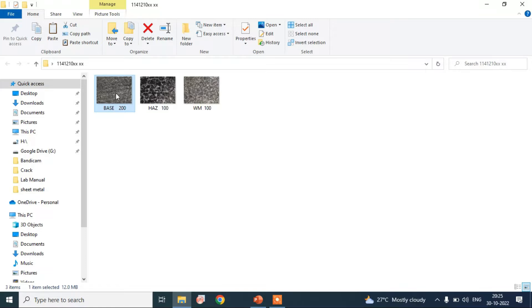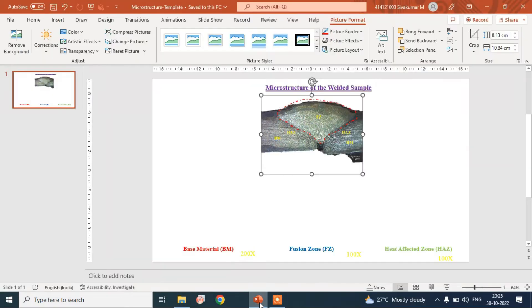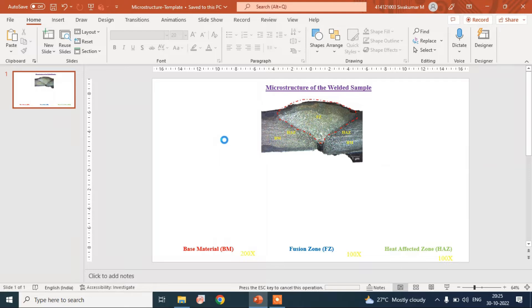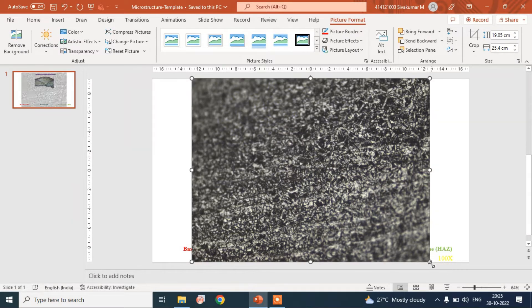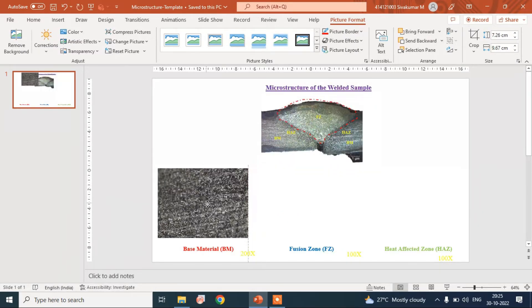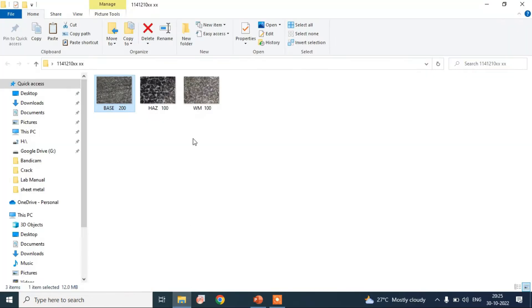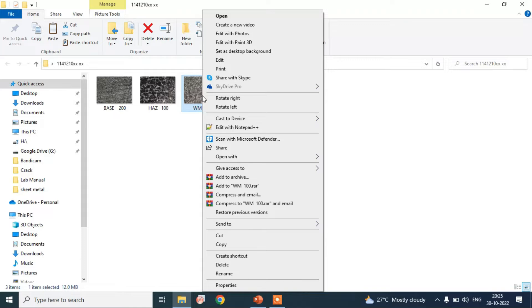The base material microstructure has a magnification of 200x — copy and paste it into the PowerPoint presentation. The fusion zone has a corresponding magnification of 100x.